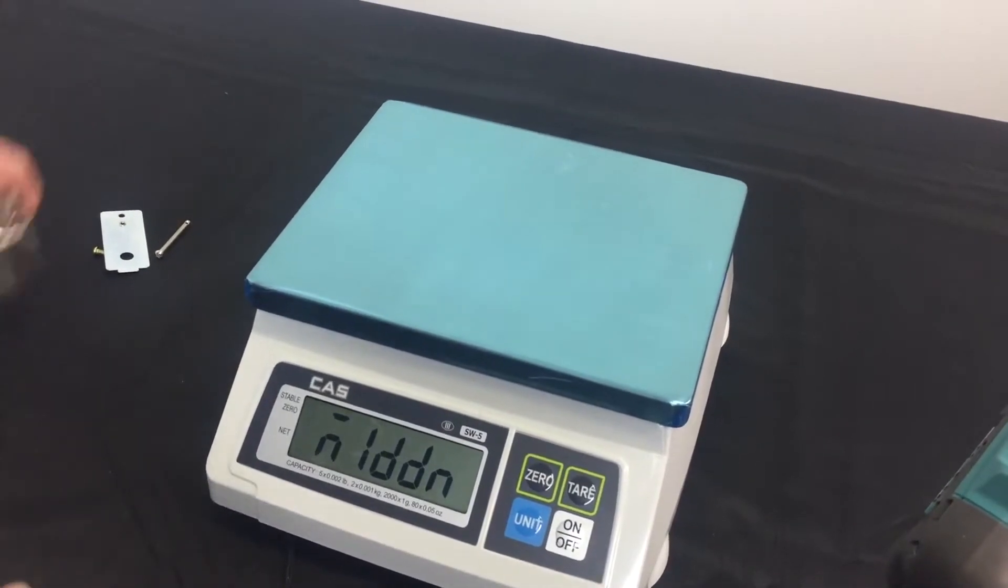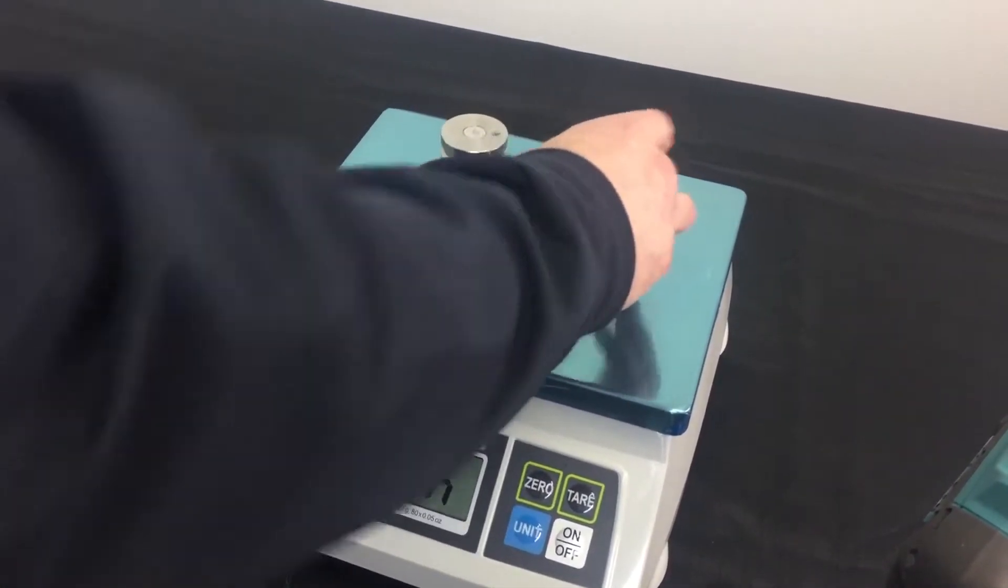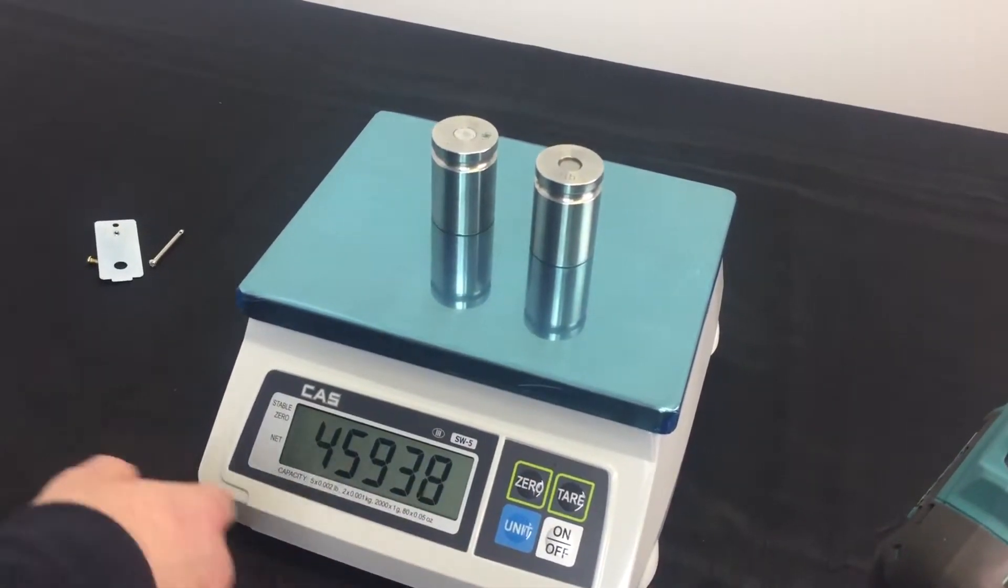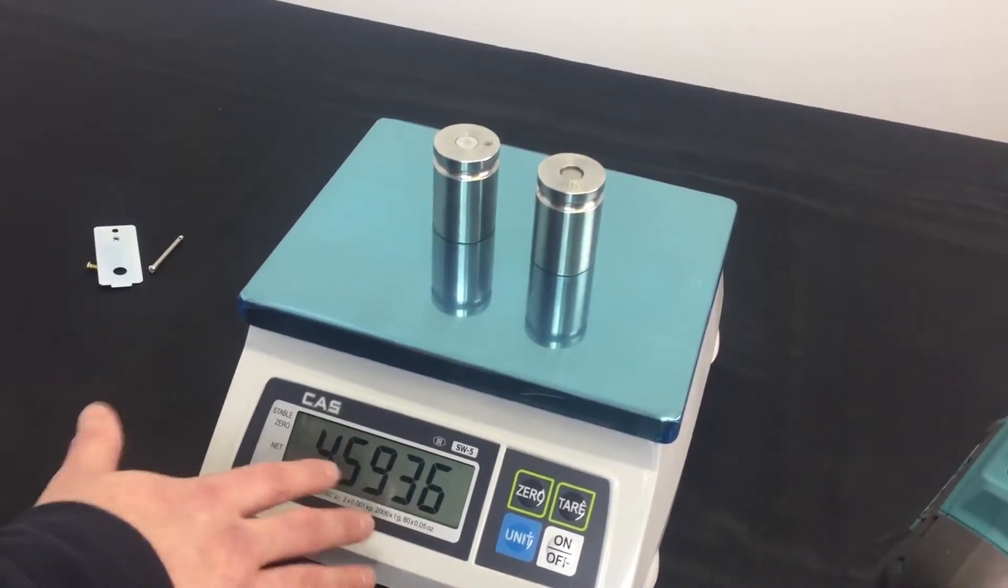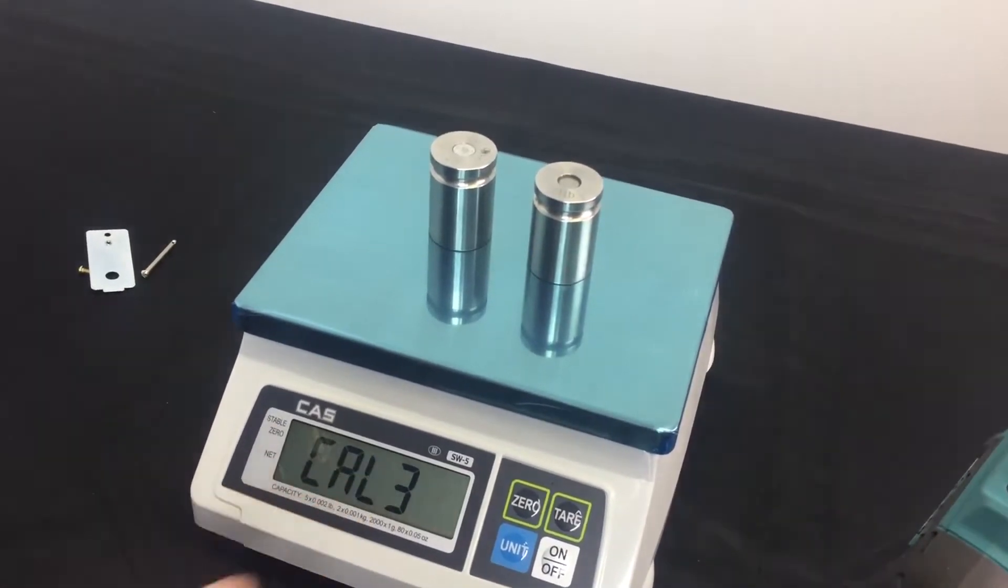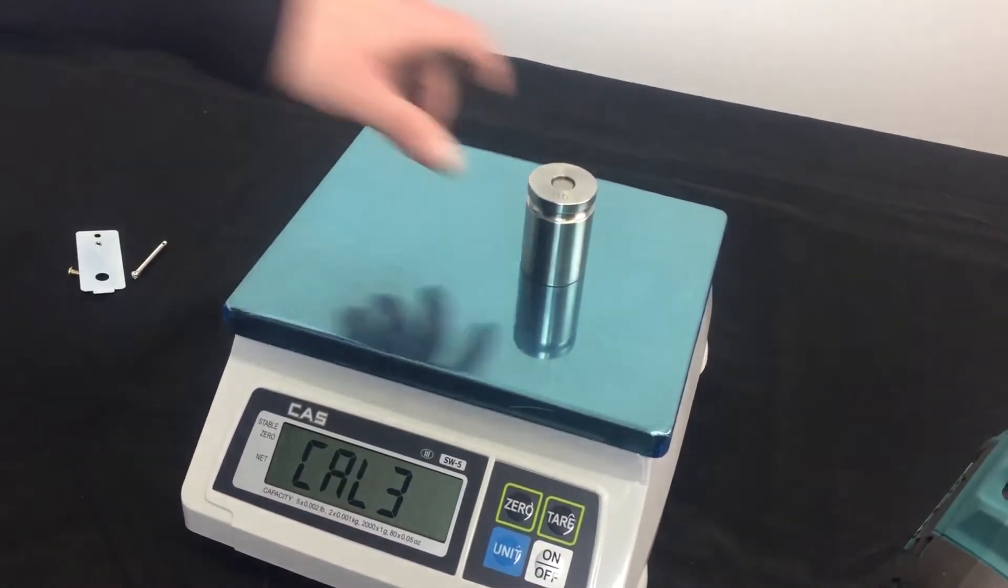Now, we go back to the middle weight for our three-point calibration. Two pounds again. Press the zero key. Now, we see our weight. Now, our raw counts are good. And done. It shows Cal 3 on the menu.